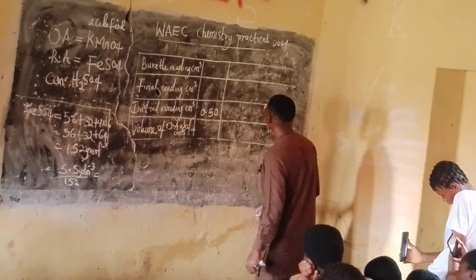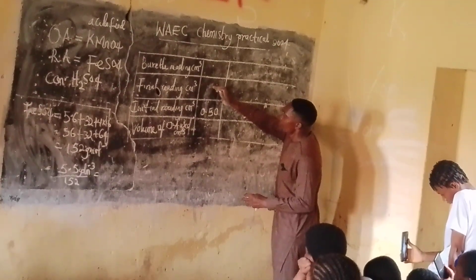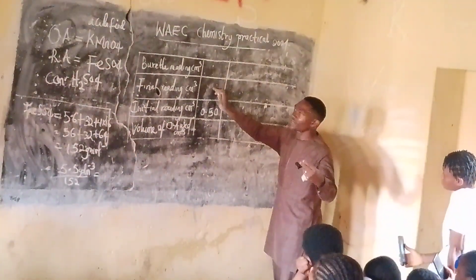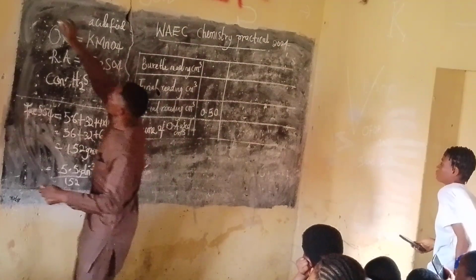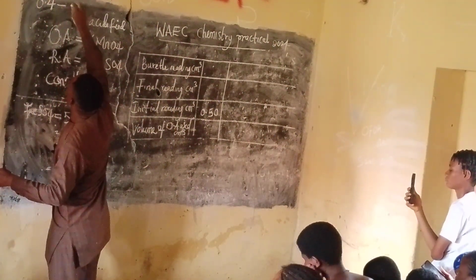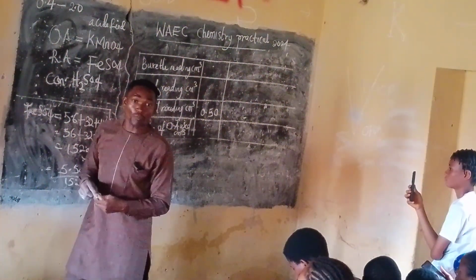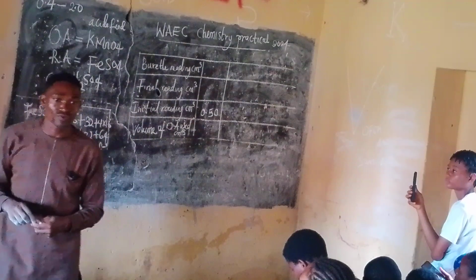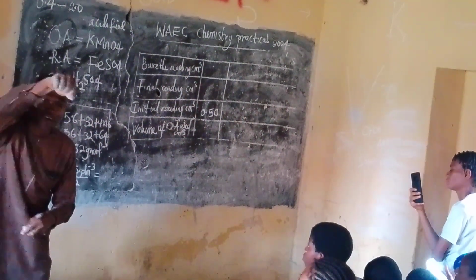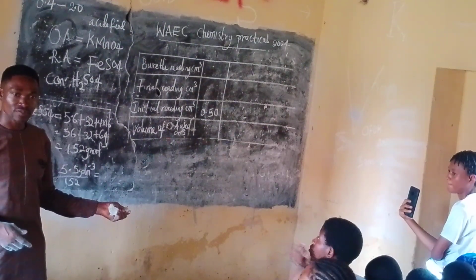Having that in mind, I will create a rough. I use these values, 0.4 to even 2.0. So the minimum value I can add to give me a rough is 0.4. Are you with me?